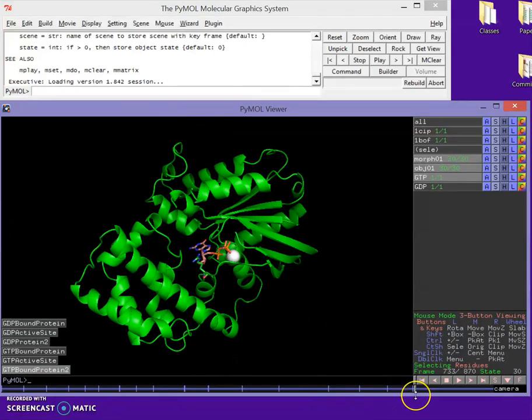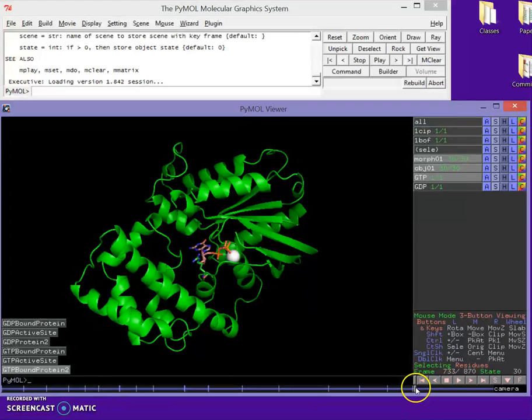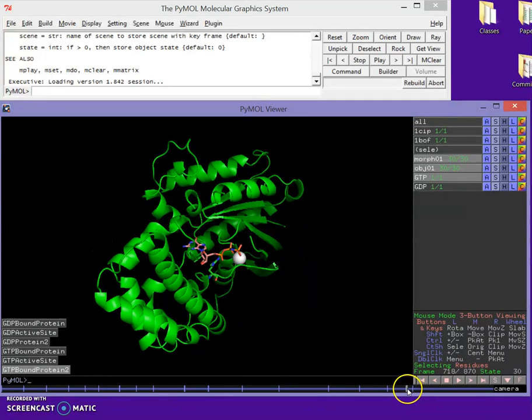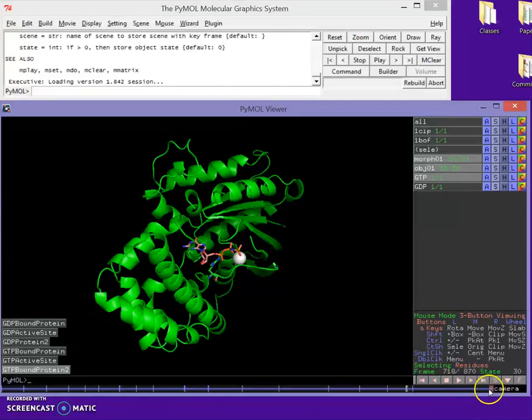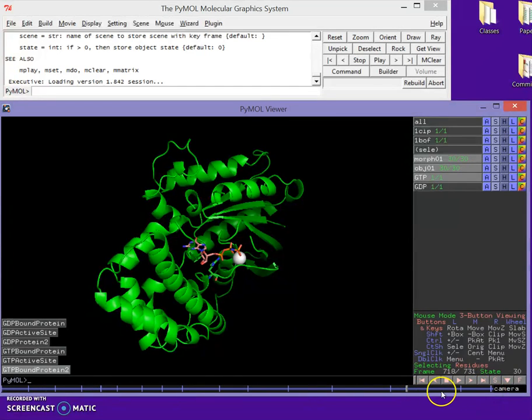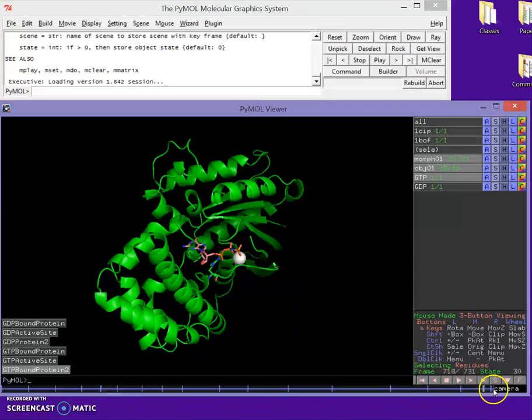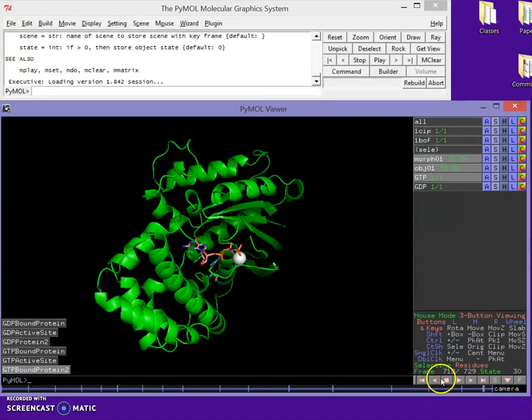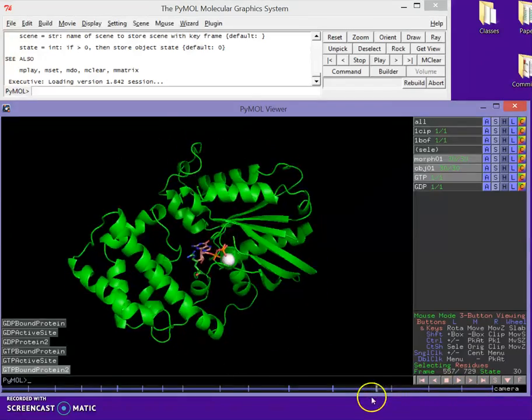Cool. So it looks like we got our whole movie programmed in. Now I've got some extra frames at the end I don't care about. So what I'm going to do is I'm going to hold down control. At the end, I'm going to left-click and drag until I get right up to the next to that last scene. And I'm going to do it until just right there. So that's our whole movie there.